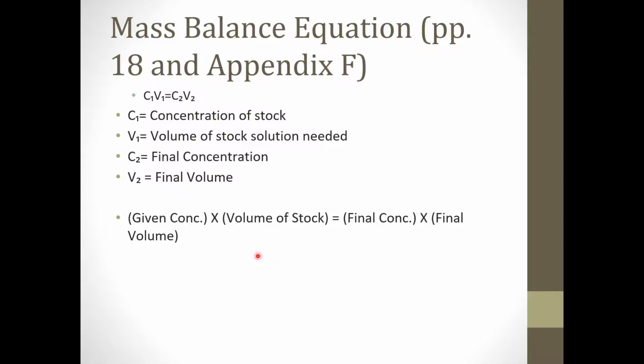Another tool you need to understand this week's lab is the mass balance equation. This is an equation that is used to figure out how to make dilutions. It works on the basic premise that C1, the concentration of the stock solution, the solution in the back of the lab, let's say, or the solution in a container, times the volume of the stock solution will equal the concentration that you're making times its volume.